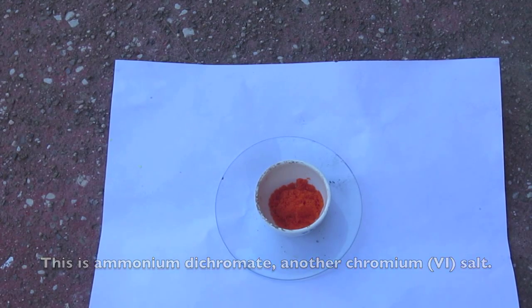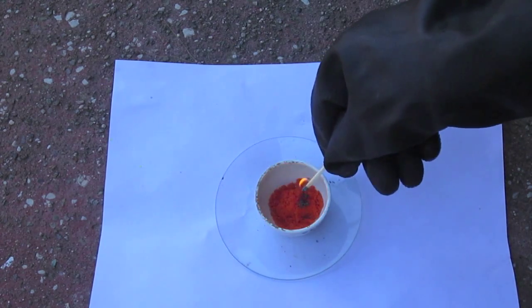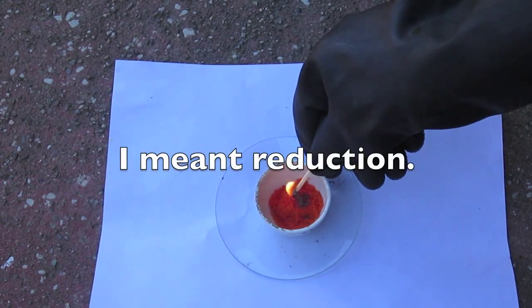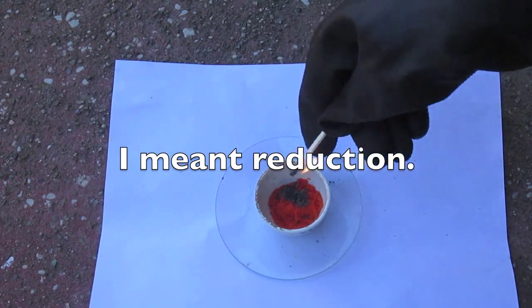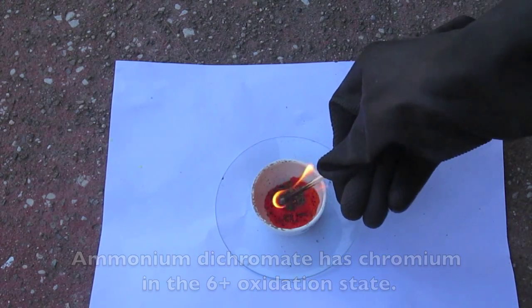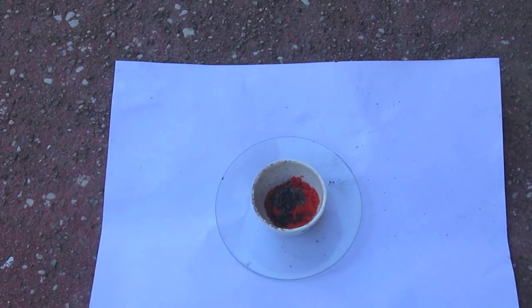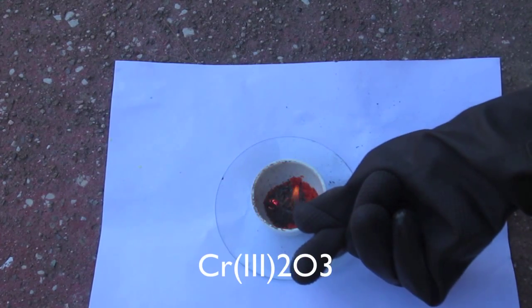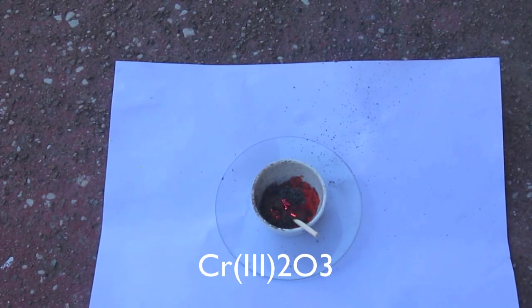Chromium in the plus six oxidation state is extremely unstable and is susceptible to easy decomposition. Here is ammonium dichromate. When I heat it up with a match, you'll see that it decomposes to form green chromium dichromium trioxide featuring chromium in the three plus oxidation state and it also forms water and nitrogen gas.